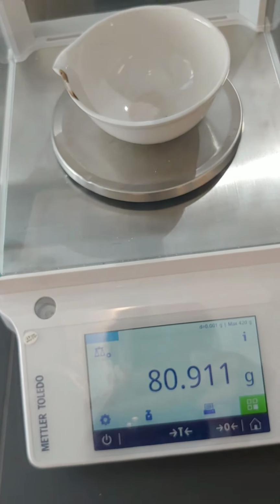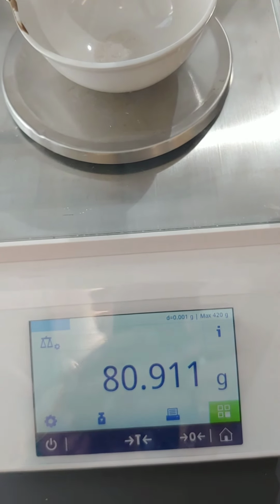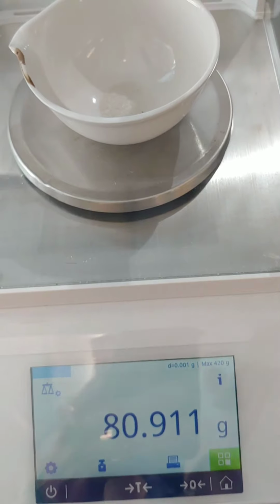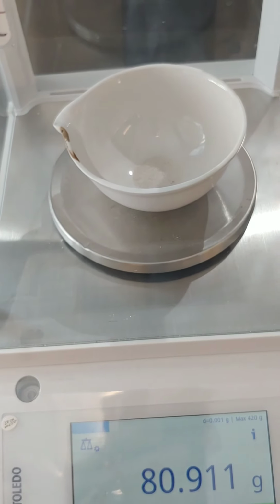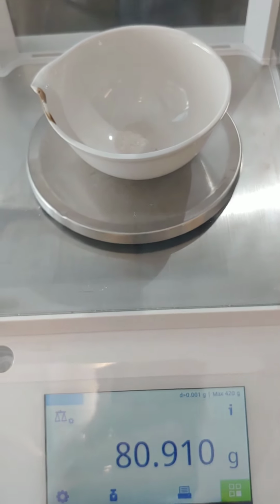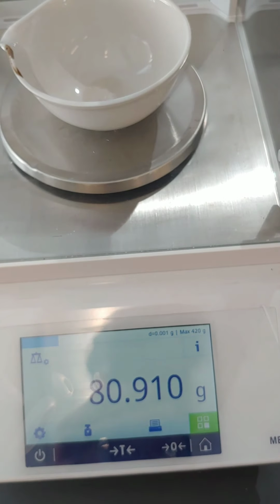The mass of the dry sand in the dish is 80.911 grams. So this is after I've allowed the dish to cool and weighed it. We don't want to put hot things into the balance to weigh them, because they can radiate heat, and that can lead to convection currents, and then that will change the weight, and the weight will actually start to fluctuate. It's fluctuating just a tad here, 80.910.